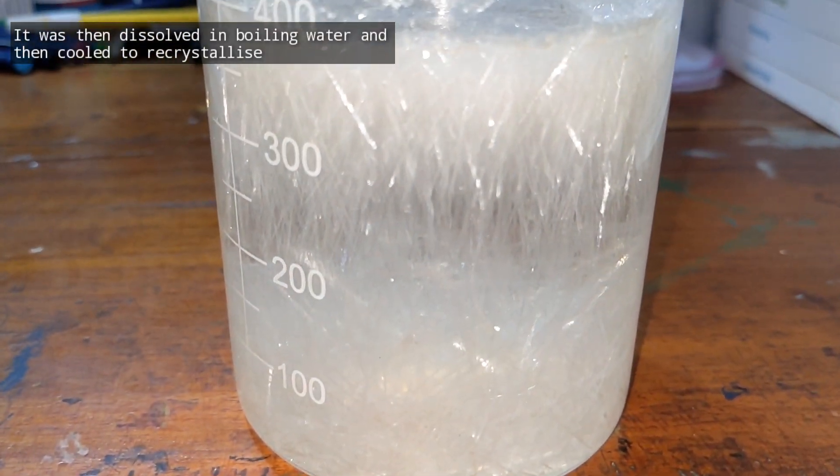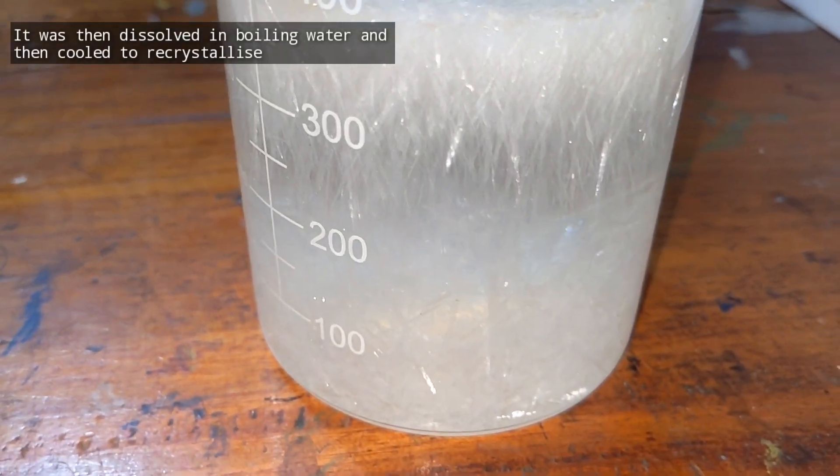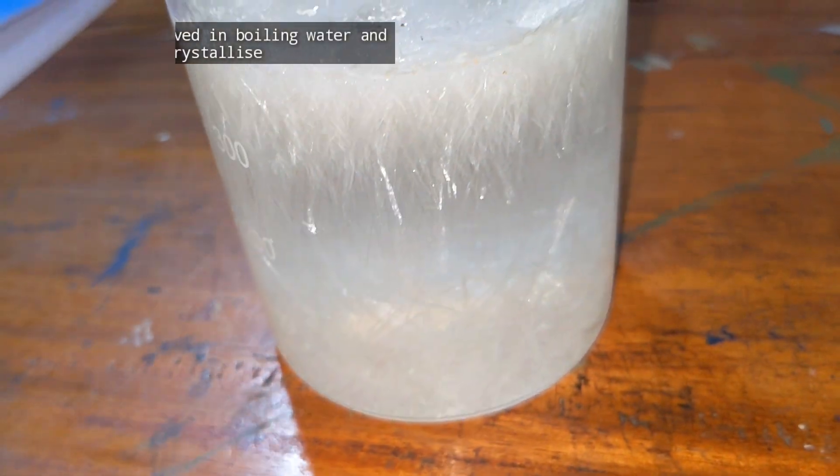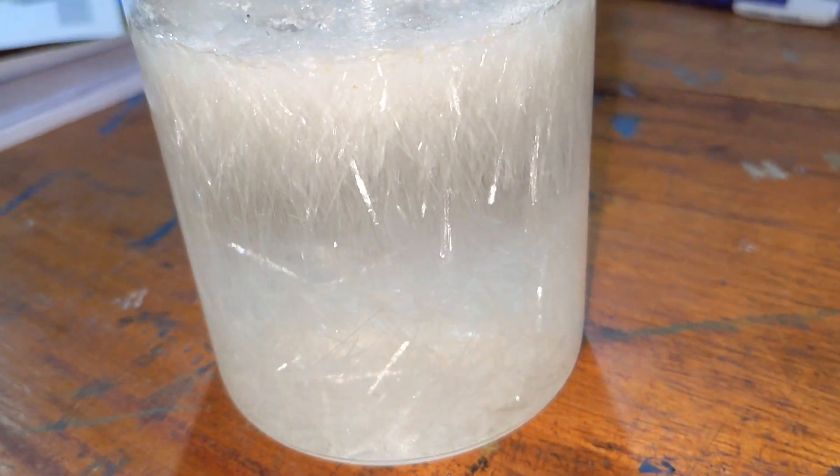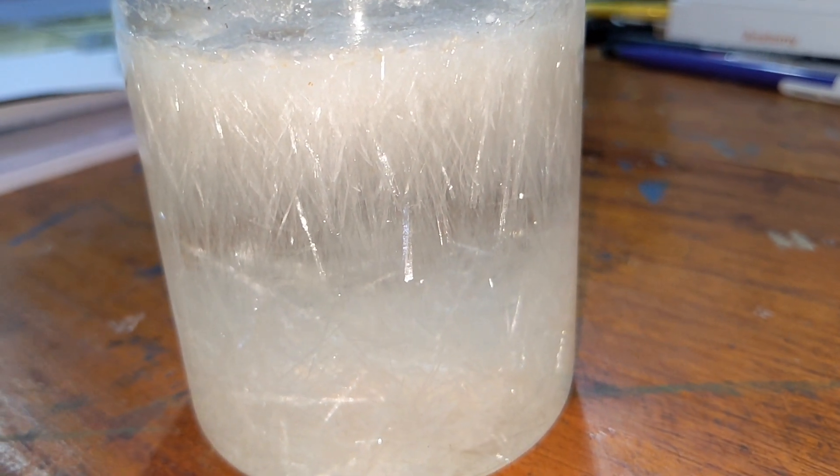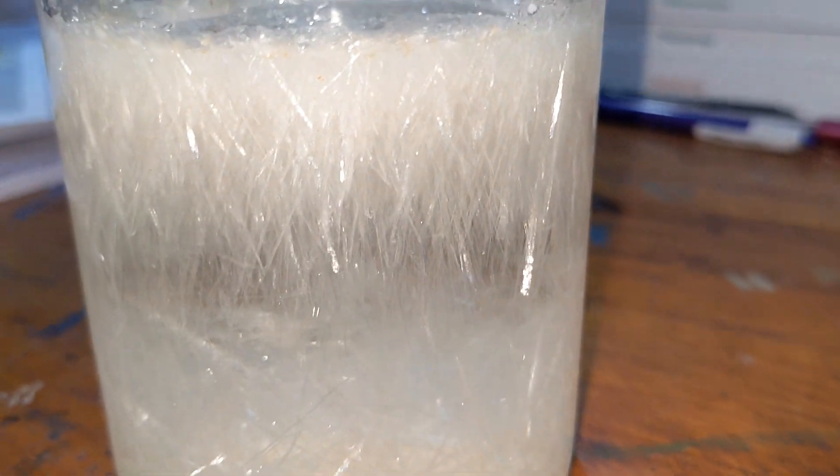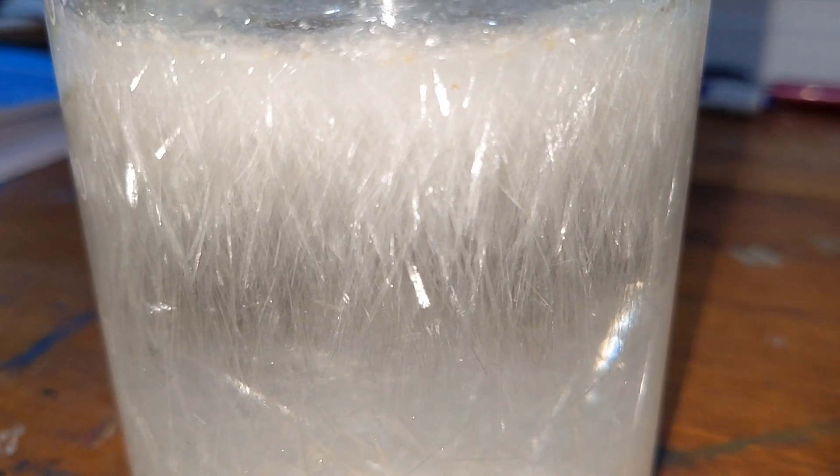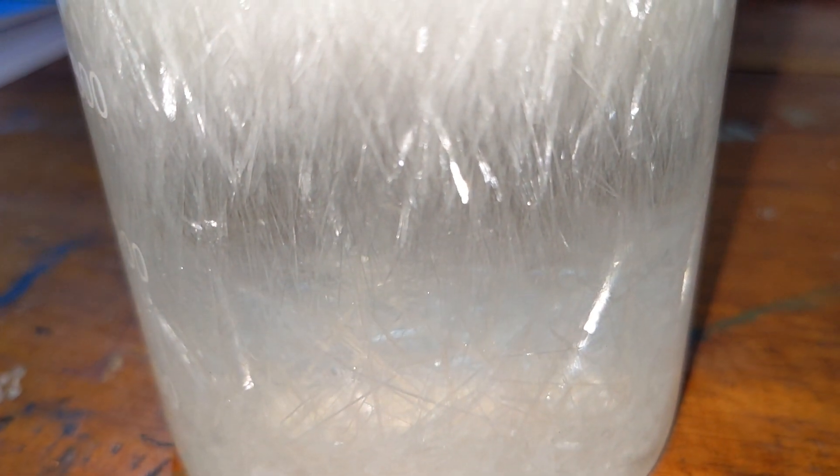These are the beautiful needle-shaped crystals of pure benzoic acid obtained by recrystallizing using hot water bath. I obtained around 15 grams of benzoic acid which represent about 88% yield.